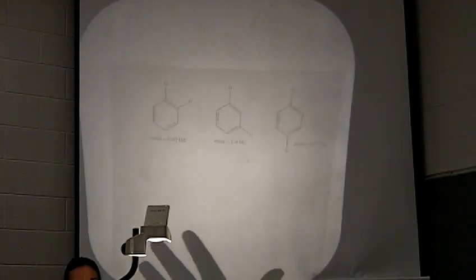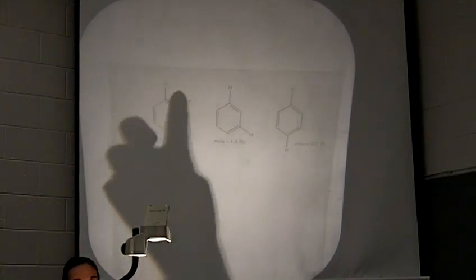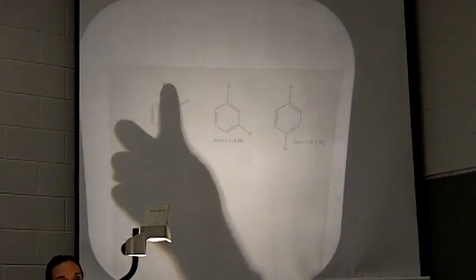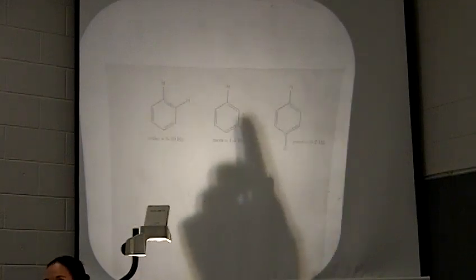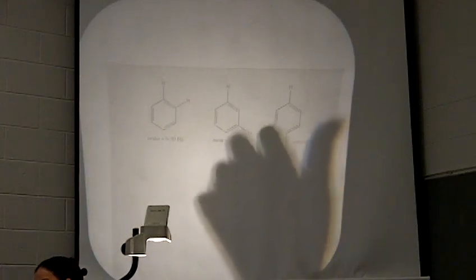This is really the only place you're going to get this, because they don't really cover it a whole lot in lecture anymore: how protons on aromatic rings and across double bonds are related to each other and how they affect one another with their coupling in their electronic interaction around the ring or across the double bond, all right? As far as chemical shift, it was not changing for protons being next to each other, all right? But what happens in the splitting pattern and the coupling does have an effect, okay?